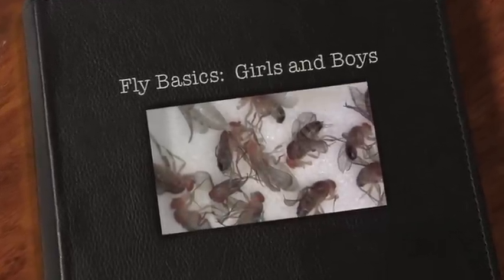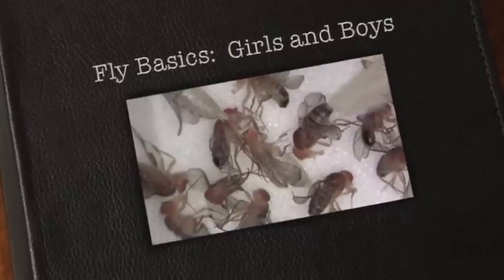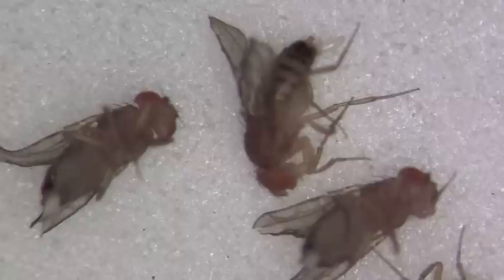The purpose of this video is to help you identify male and female Drosophila flies.